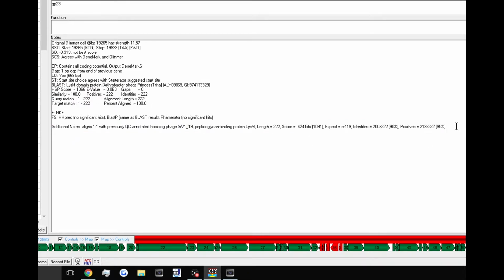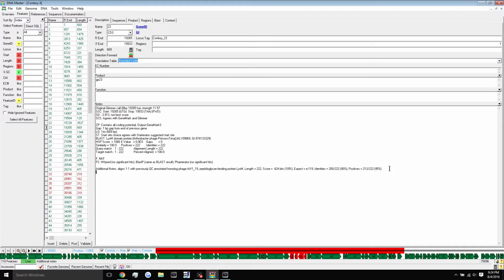If you didn't list Princess Trina, we're going to note to the QC people below. Maybe put a period here, and we're just going to say that it also matched with the Princess Trina phage as well.